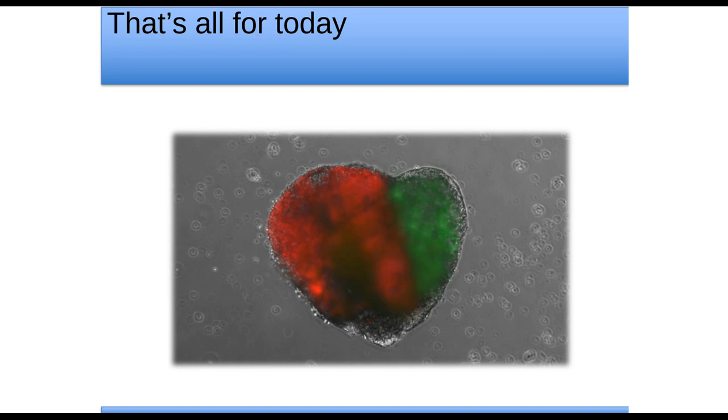Thank you so much. And did you use any specific approaches for sorting cardiomyocytes with high viability? Yeah, that's also a great question. One of the most important steps here is to have a good and robust dissociation protocol. Typically a lot of cells tend to die during this stage when you dissociate them, so make sure you have a good, reliable dissociation protocol. Then after that, we use PBS that we supplement with HEPES, typically around 10 millimolar.